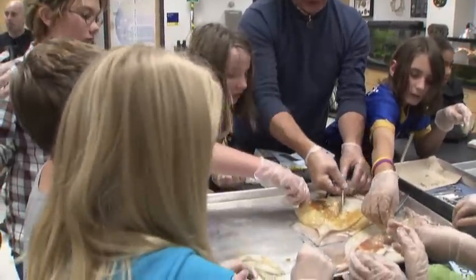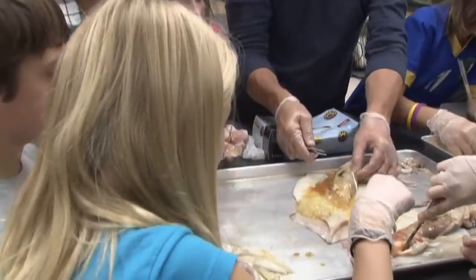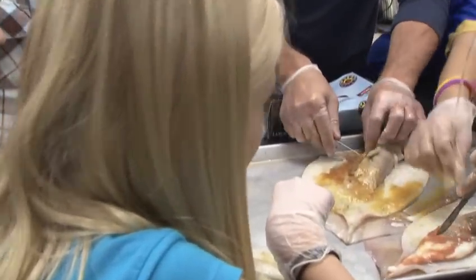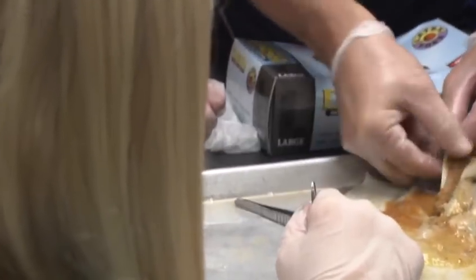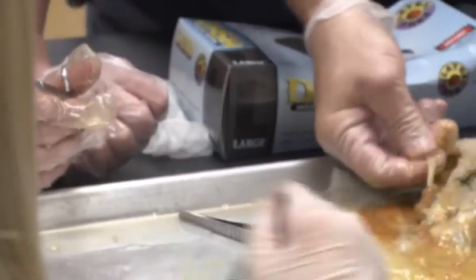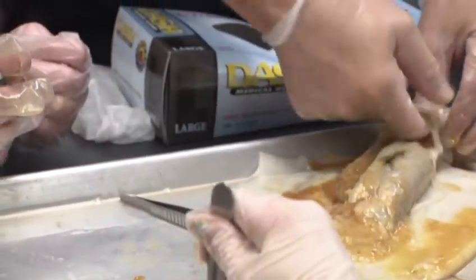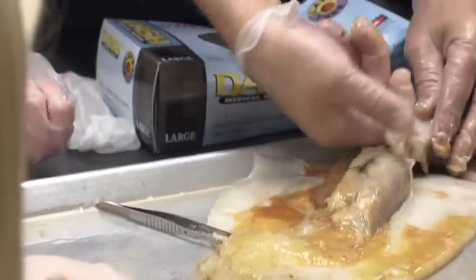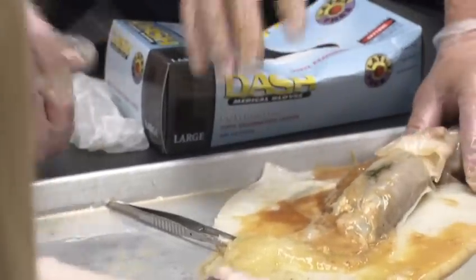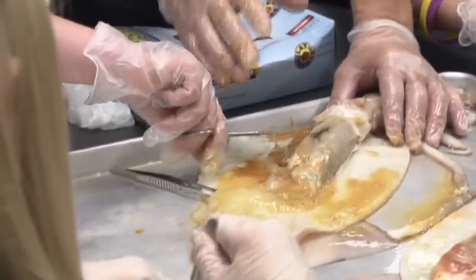Watch, I'll pull this side over here. There's cartilage right there. And there's another one over here because you've got to have two, because it's bilateral, right? So you bring in the water, you push it back out this funnel right here, the siphon, and you can aim it any way you want, up, down, backwards, forwards. So these guys are not only smart, but they're really fast.